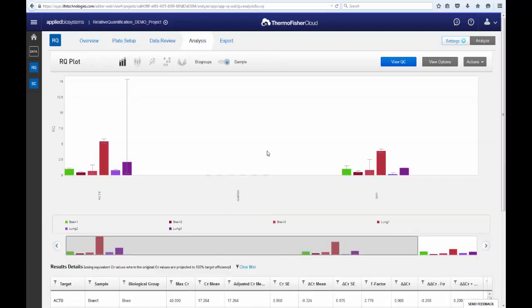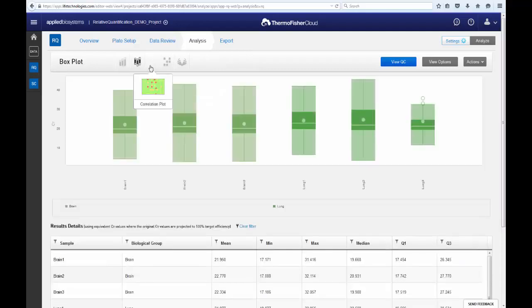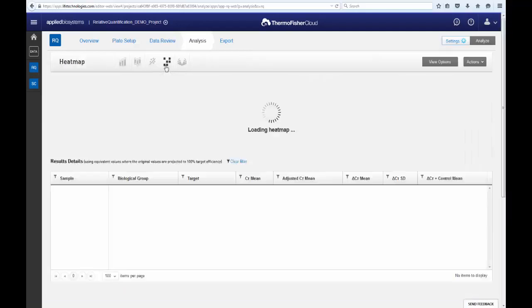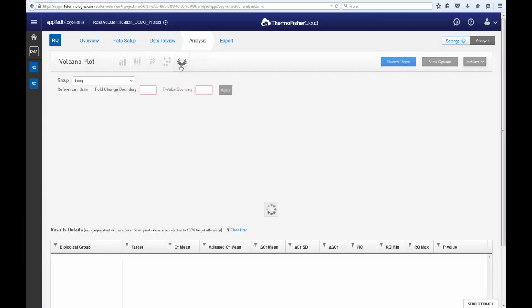In this tab, you can visualize your results in many different forms: RQ plot, box plot, correlation plot, heat map, and volcano plot.